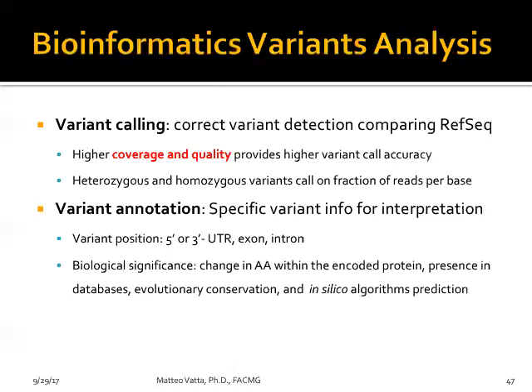But towards the 300 cycle, the base quality will go down. Yes, yes. So you're looking at the first, let's say, 75 to 100 cycles are going to be your gold mine, and then at the very end your quality may go down. And yeah, because the reagent is already there. Yeah.